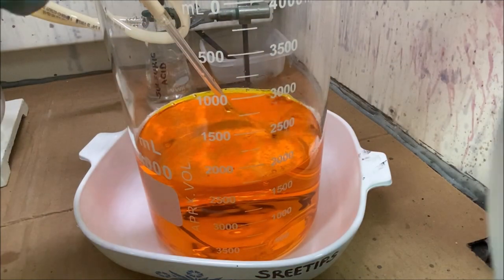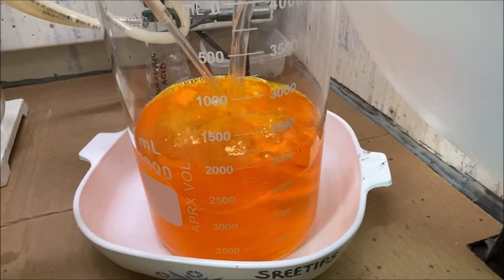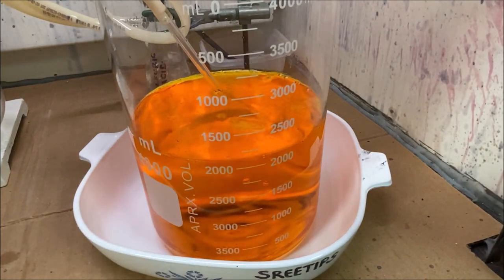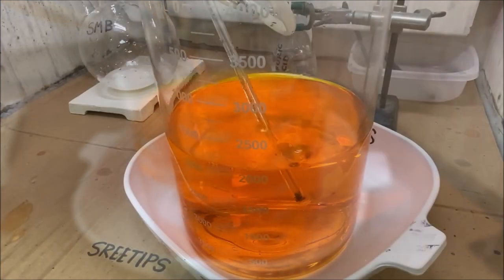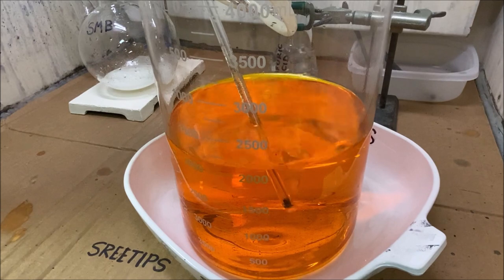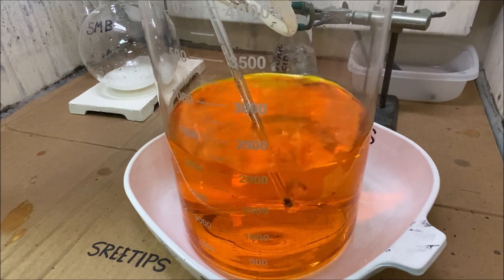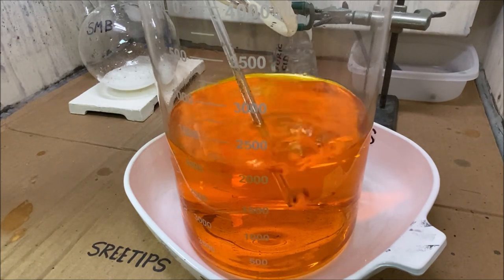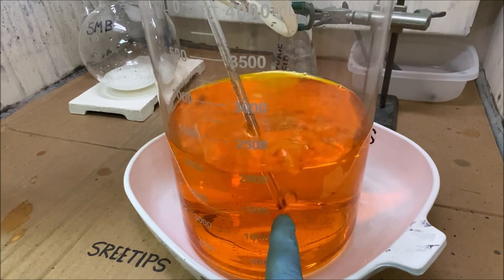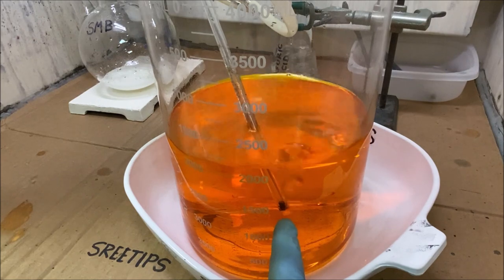I'm going to add about half a liter of distilled water. This reaction happens better when the solution is dilute. I had the end of the pipe leaning on the bottom of the beaker. I don't know if you can see that or not, but I've got some gold building up on the delivery tube there, right here. So we may have to get in there with something and unclog that if it gets worse.